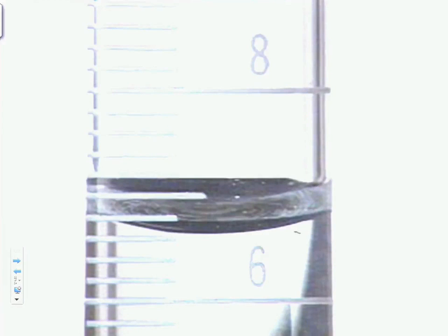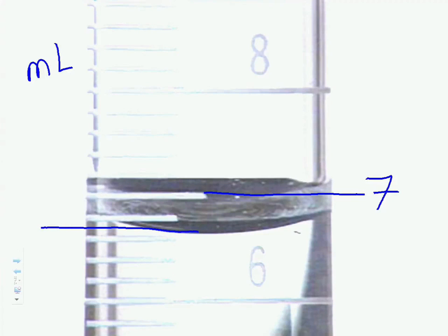All right, give this one a try. Okay, so there's our seven. Our units, does this look like a graduated cylinder? What does it look like? Kind of to me, it looks like a graduated cylinder. So our units are going to once again be milliliters. Okay, our meniscus is here. Is this number 6.4, 6.6, 6.8, and then 7.0. Okay.